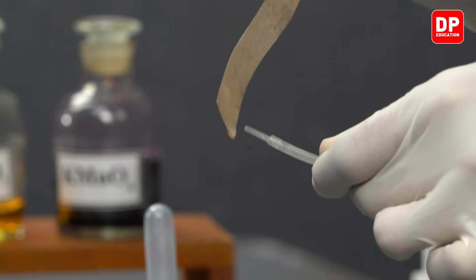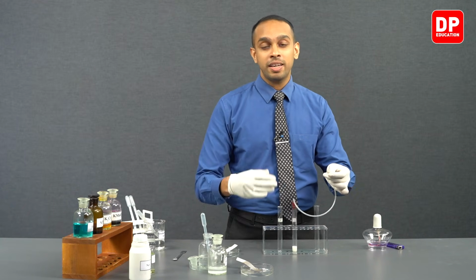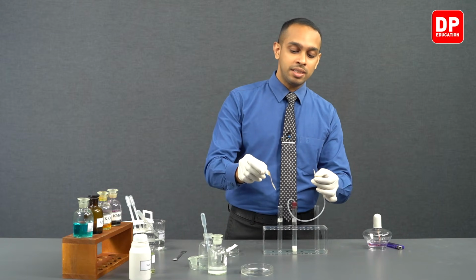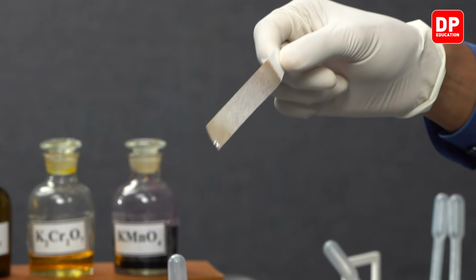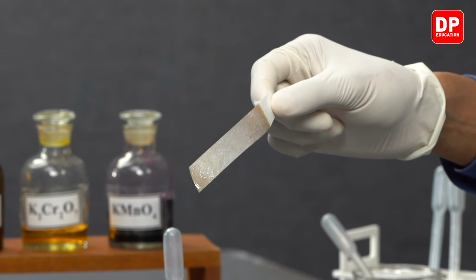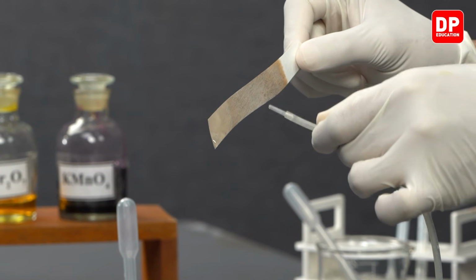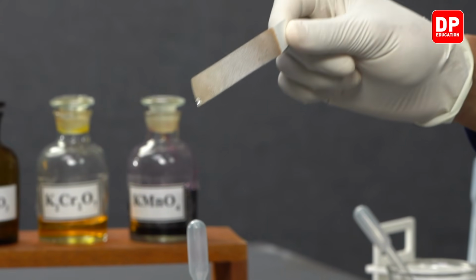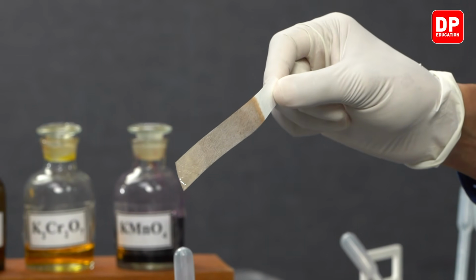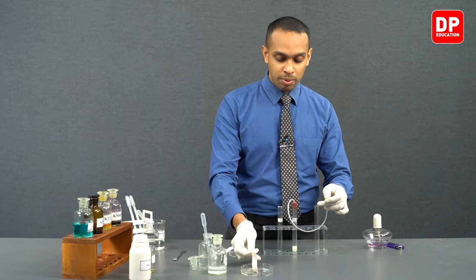This is because the produced hydrogen sulfide gas, when it comes into contact with lead acetate, forms lead sulfide, which is a black color precipitate. And over here you can see that it has turned black when we introduce hydrogen sulfide to this filter paper soaked with lead acetate. So students, this is the observation that we were aiming to obtain.